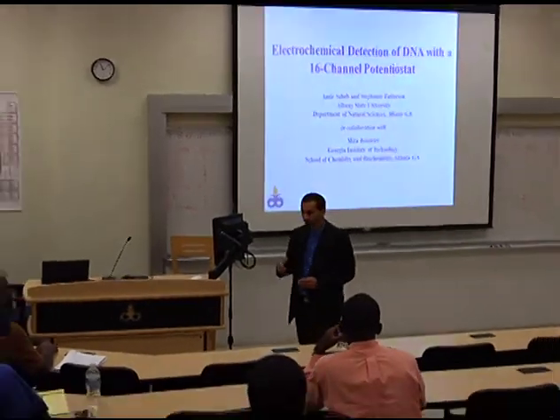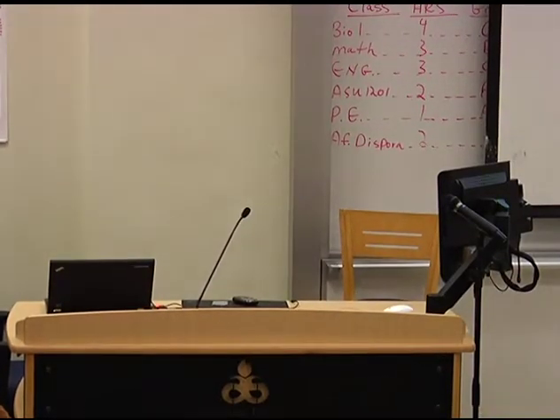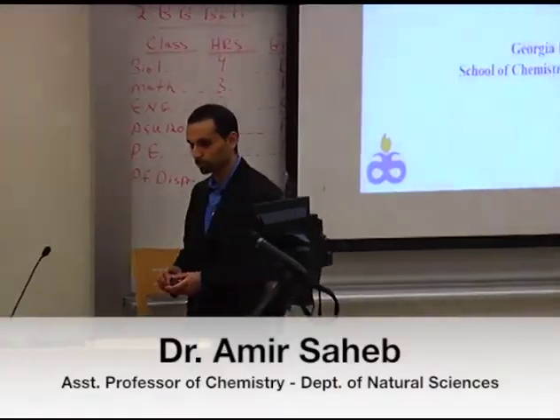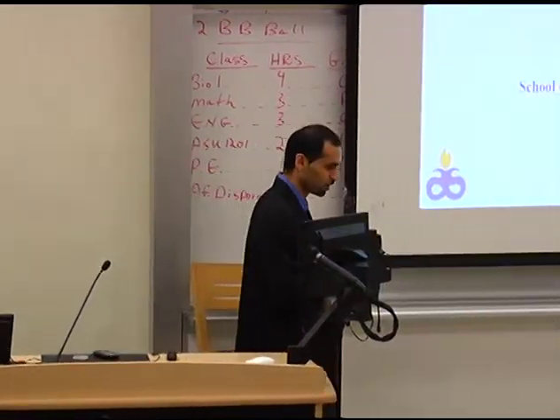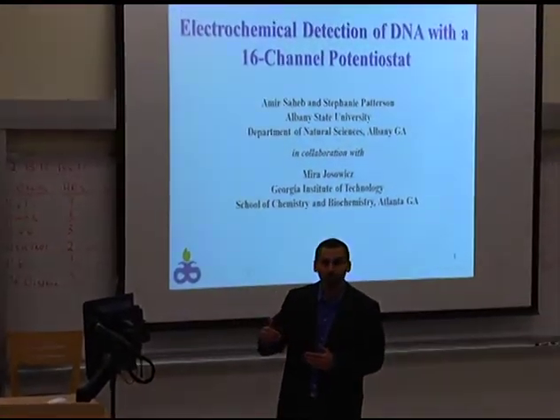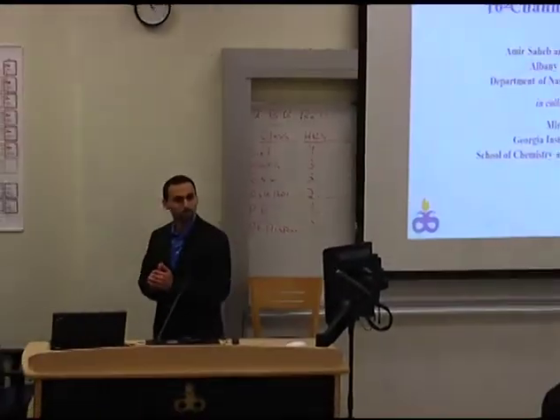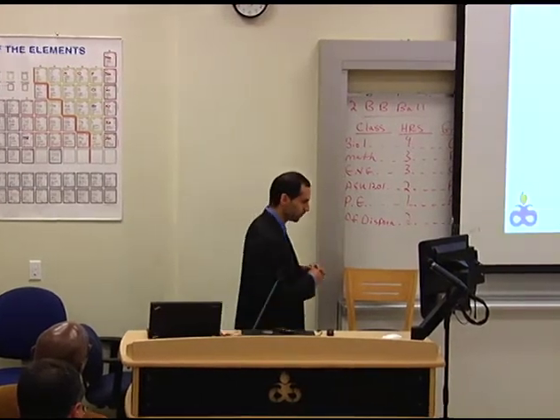Now, today I'd like to discuss some of our research with electrochemical sensors. In particular, a new instrument we've developed. It's a 16-channel potentiostat. Now, you might already be familiar with my research with detecting DNA sequences using a typical potentiostat with an electrochemical probe. Now, the 16-channel potentiostat is much more powerful because you can do 16 individual experiments basically at once. 16 individual sensors operated simultaneously.